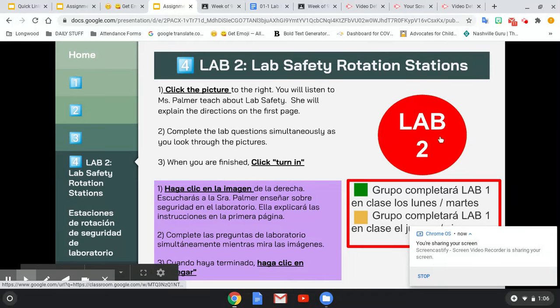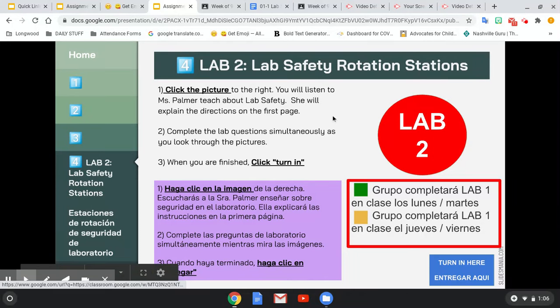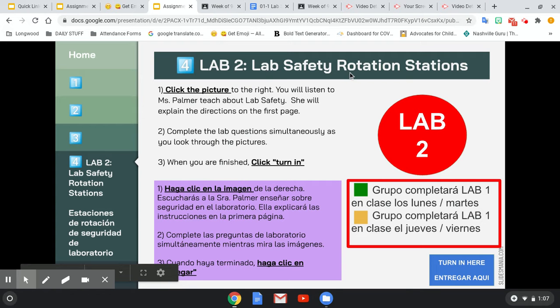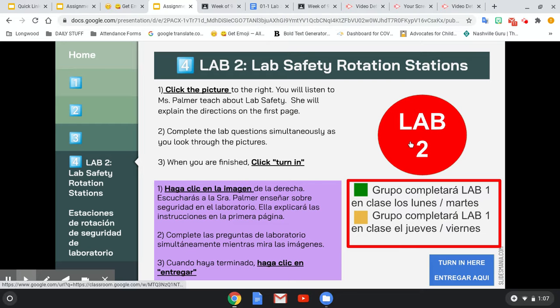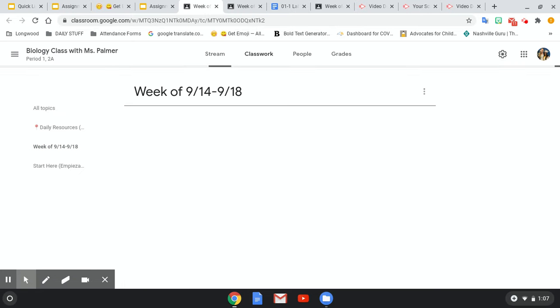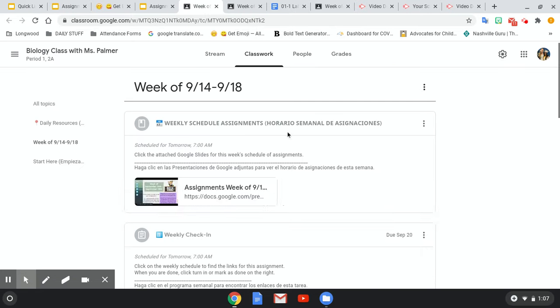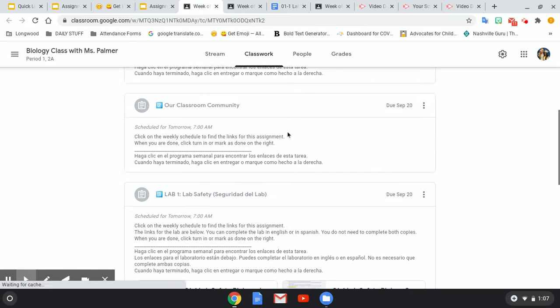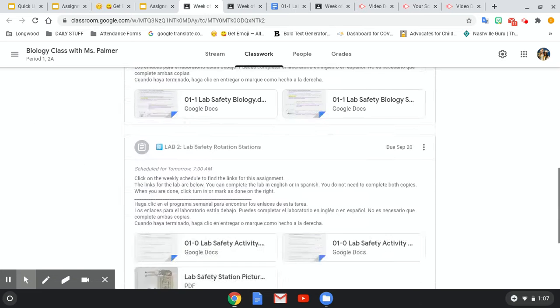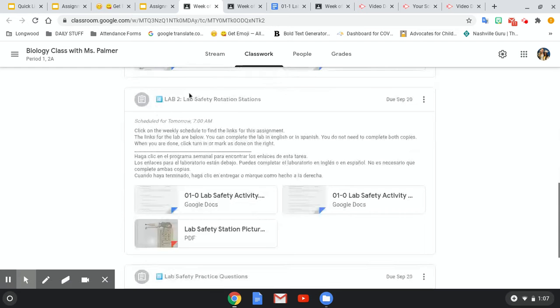Alright, this is the second lab that we will do. Lab 2, Lab Safety Rotation Stations. Click the picture to the right and you will listen to Ms. Palmer teach about lab safety. So click lab number 2 and it will bring you again to our Google Classroom page. You will go down to lab number 2, which is right here.